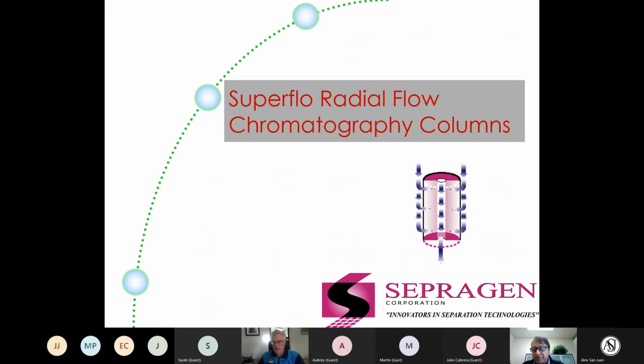The principles of radial flow columns, problems that they solve, applications of the radial flow columns, and we have embedded in the presentation a couple of videos showing how the columns actually work. So right on this front page, you can see the animation of the radial flow column. It generally shows you how the flow is actually taking place in the columns. It doesn't go longitudinally through the column, but the columns are like a cartridge where the flow is applied all the way from the outside in.